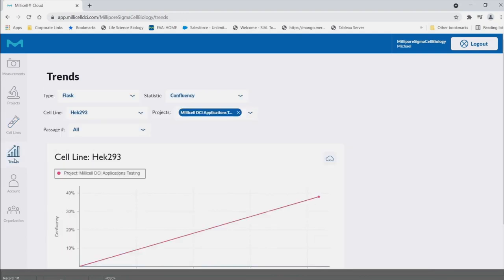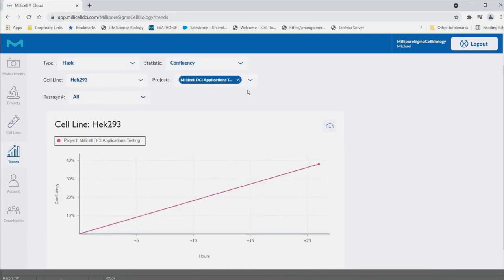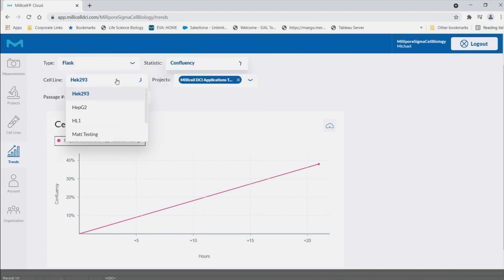Trends. Within the trends tab, data can be plotted according to different parameters. For example, cell line, statistic, etc.